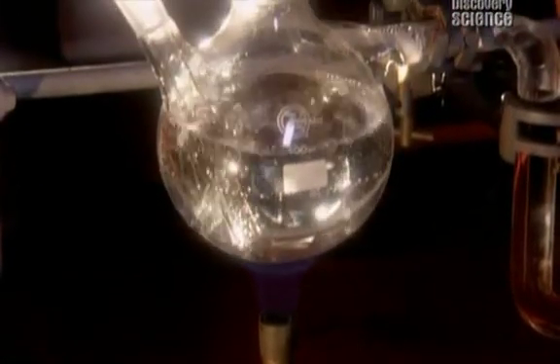This small flask of boiling water represents the sea. As the sea evaporates, a mixture of gases is introduced. The gases dissolve in the steam and the whole lot enters this chamber here. And it's in here that the really interesting chemistry happens.